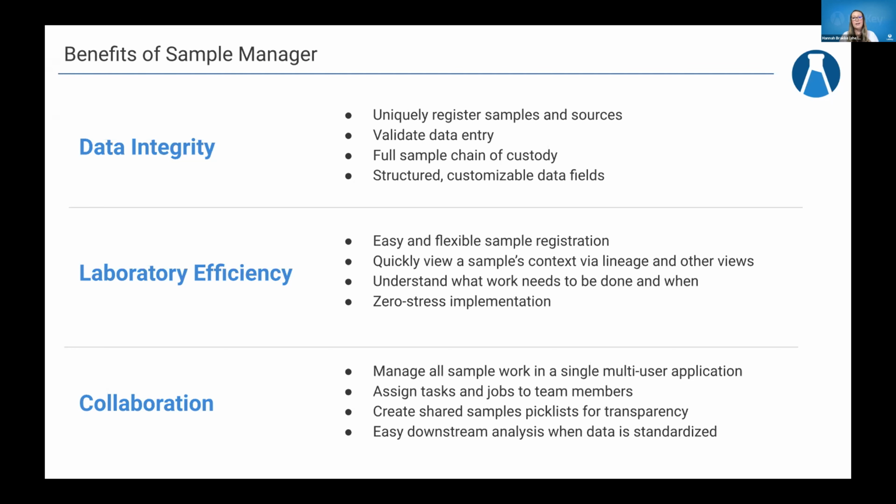So we allow for sample registration to happen in a lot of different ways within the application. First and foremost, you can take a file of samples that you have, maybe in Excel or a spreadsheet or an export from another system. If that's in the right format, you can upload that. We also have built-in registration when you are wanting to create samples within the application. So once your implementation and migration is done, you can start using it directly in there. You can stop using the spreadsheets.